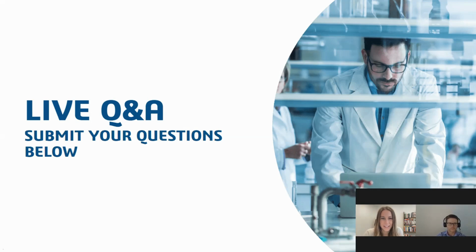Thank you. Next question here is, is your knowledge graph a proprietary data standard? Sure. So, really, the knowledge graph is a technology for defining the relationships between the pieces of metadata. So the taxonomies and ontologies that you apply there are really flexible. And we normally align those with things like the Allotrope data format, or whatever ontology our customers want to utilize. So it's not a proprietary data standard. It's something that uses the different pre-competitive alliance-defined data standards, and is very flexible to exactly what a customer wants to utilize.